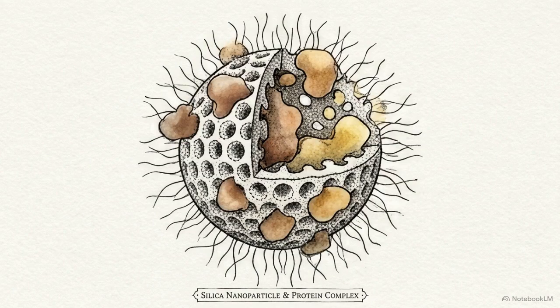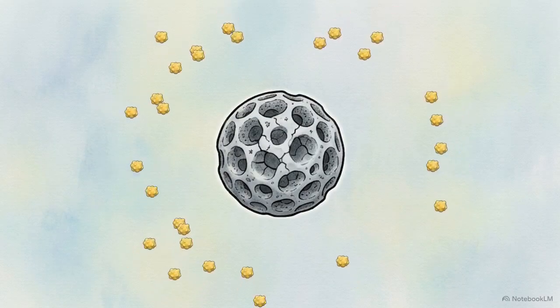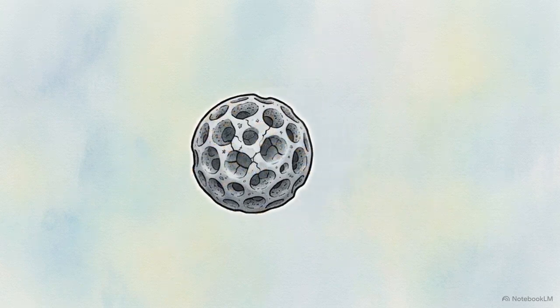This kinetic volatility is even more critical at the bio-nano interface, the moment synthetic nanoparticles enter biological fluids. Immediately upon injection, a biomolecular corona forms, a complex coating of proteins that dictates how the body reacts. Quantifying how deep these soft proteins penetrate into porous silica nanoparticles is nearly impossible with traditional imaging.